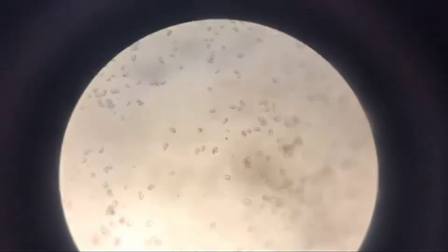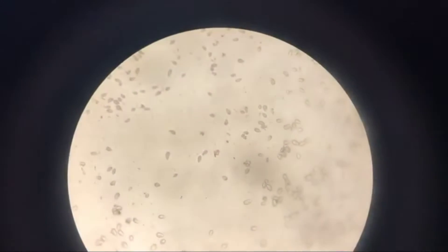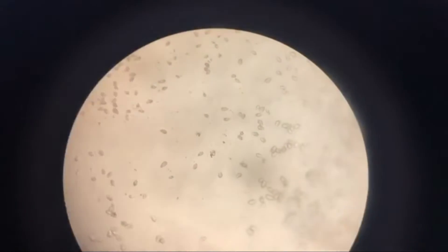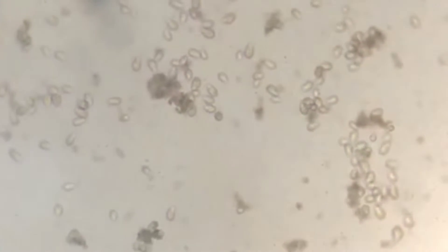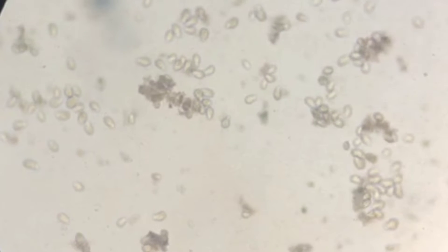This is the result of our hay infusion. As you can see, there are so many living microorganisms and they are called protists. These tiny microorganisms are called paramecium — they are single-celled organisms that belong to the Ciliophora phylum.